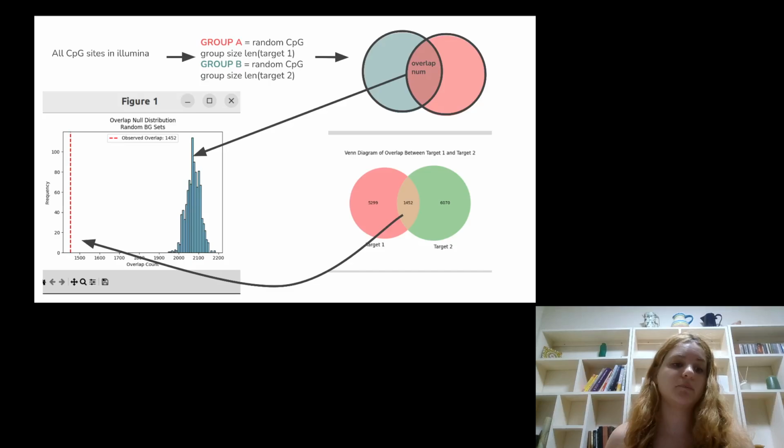And I also test two-sided, or for enrichment and depletion. If you already know that you are looking for depletion, or if you already know that you are looking for enrichment, you can take those specific values and not the two-sided, which is harsher. So in this case, we can see that I got depletion. Why? Because I get it from the left side. If I were getting it from the right side, I would get an enrichment. So that's it, and thank you very much.